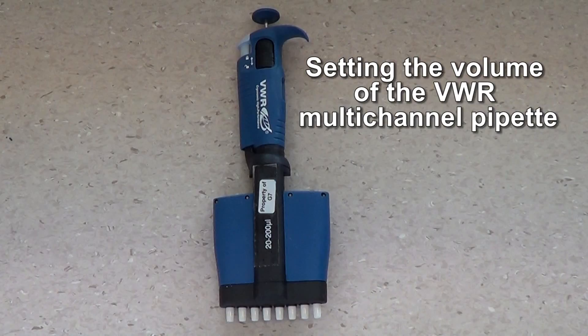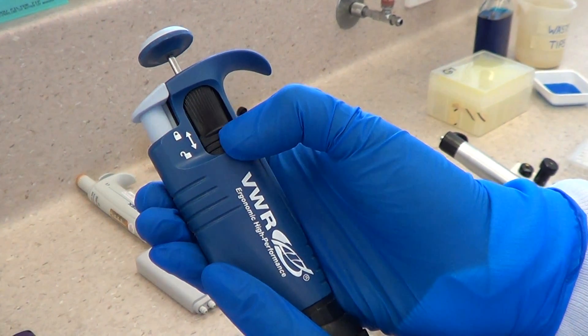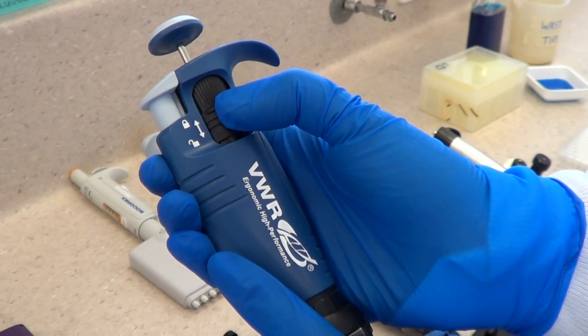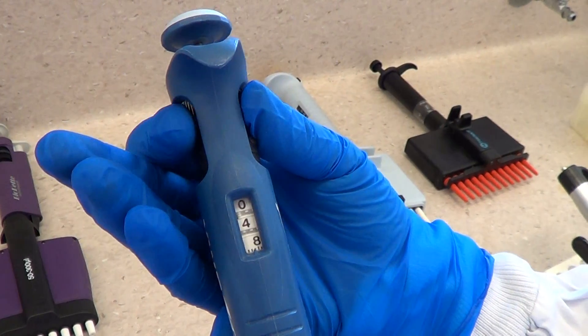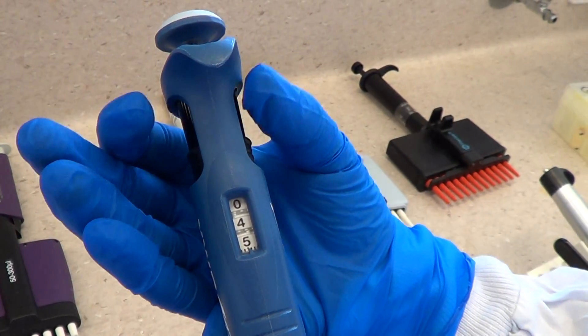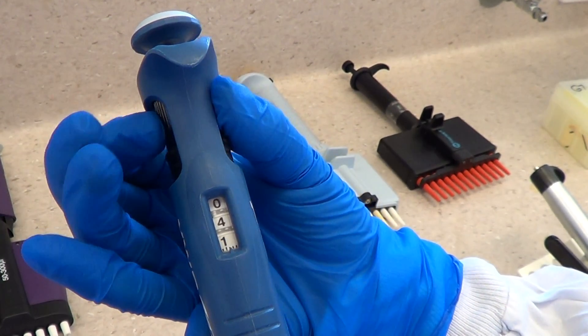Setting the volume of the VWR multi-channel pipette. First, make sure the pipette is unlocked. Then set the volume by turning the volume adjustment knob. This pipette is set to 40 microliters.